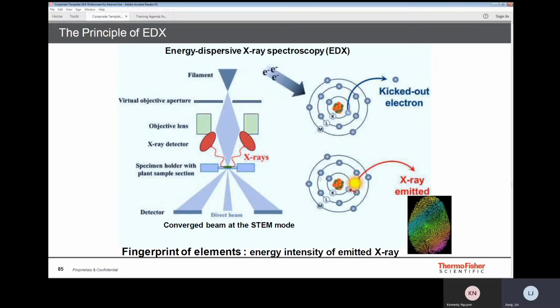So electrons from a different energy level are gonna jump in, fill that electron hole, and in this way, X-ray is gonna be generated. Different elements emit different X-rays. So we can treat this emitted X-ray as kind of a fingerprint for different elements. By collecting them, we can do chemical analysis to identify different kinds of composition.